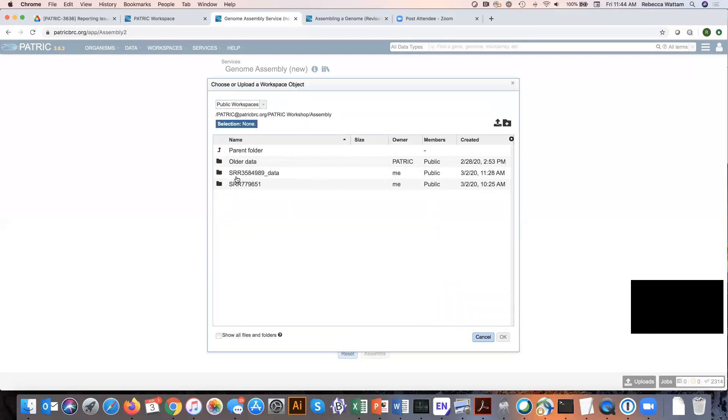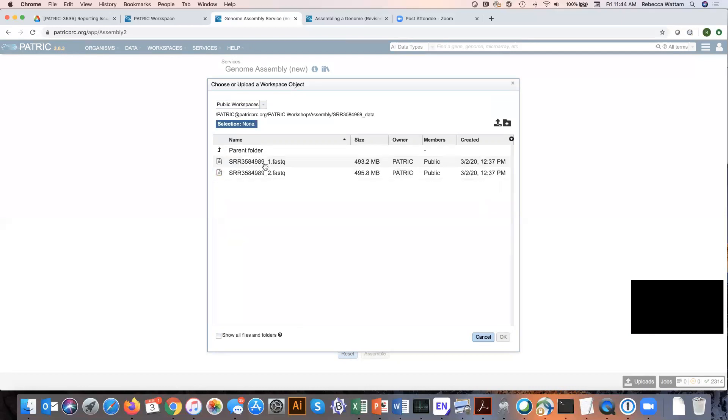Now for today's example, we're going to use this data that came from the Sequence Read Archive, this SRR 3584989 underscore data folder. Click on that. We can only click on one at a time. Let's click on the first read and then click OK.